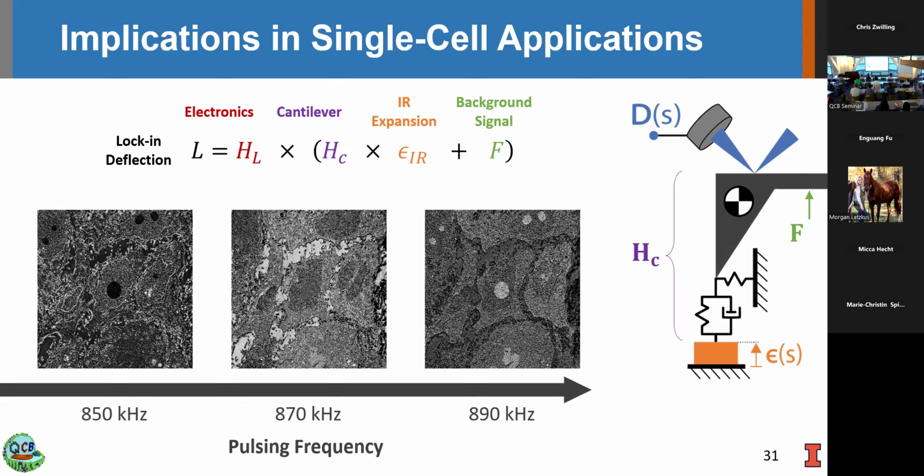So the expectation here is that each image should provide a reliable measure of the protein content within the cell sections. However, the cantilever response variations are dominant due to the heterogeneity in this sample, not typical of the really smooth polymer targets that we had, but a lot of little structural effects that happen here. So instead, what we could try to do to improve this process is to track one of the resonant modes using resonance enhanced AFMIR, which is the current state of the art in the field, to try to minimize these effects.